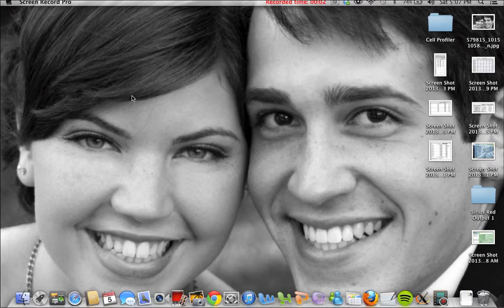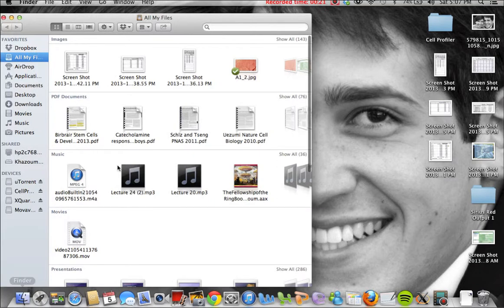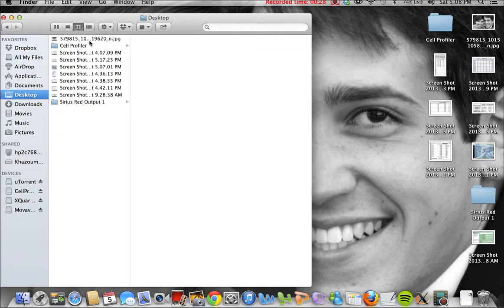Okay, so this is just going to be a video that shows you how to use Cell Profiler and basically to put the data in the spreadsheet. So first thing you're going to want to do, probably, and you can figure this out as you go as well, I would add a file to your desktop. And let's say we're going to go through sample A2.